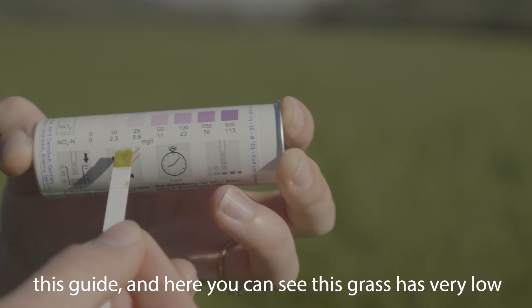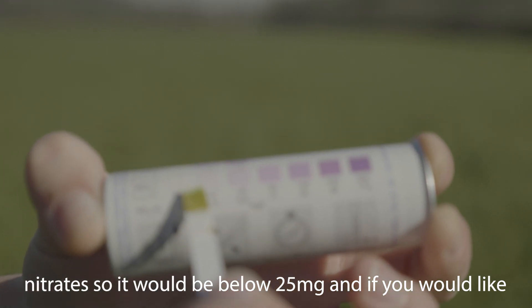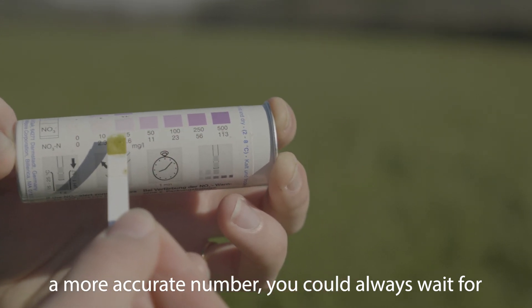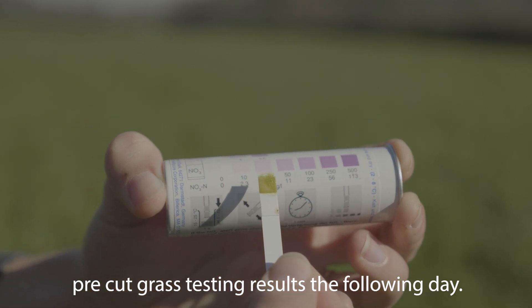Here you can see this grass is very low nitrate, so it would be below 25 milligrams. If you would like a more accurate number, you could always wait for your pre-cut grass testing results the following day.